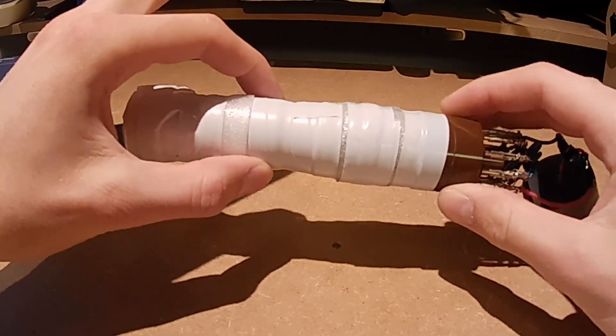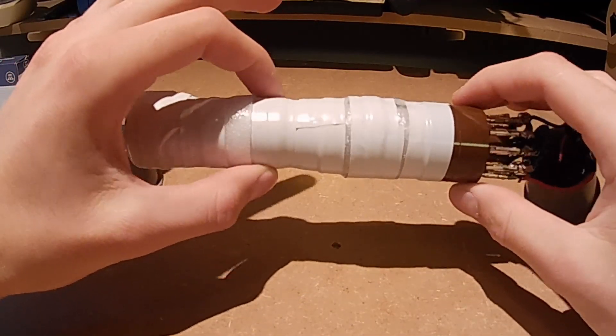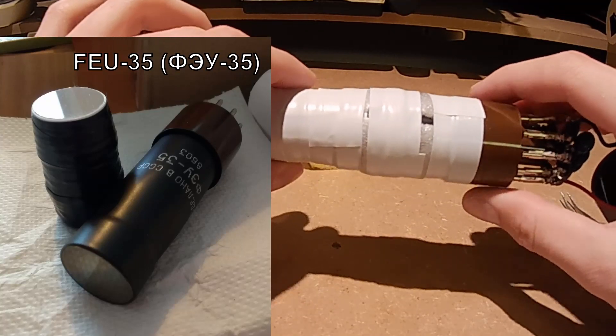Then at the back is the photomultiplier tube — in this case, a Russian FEU-35 photomultiplier.